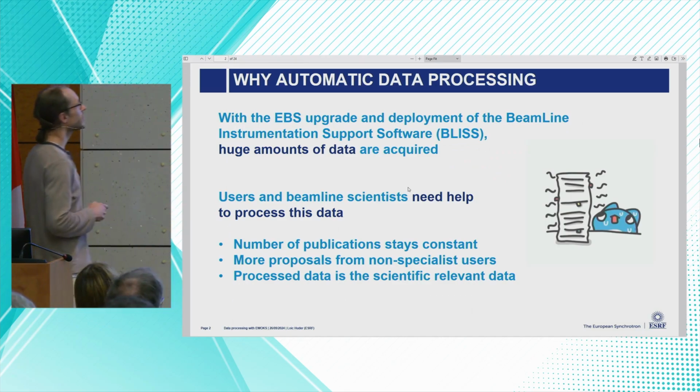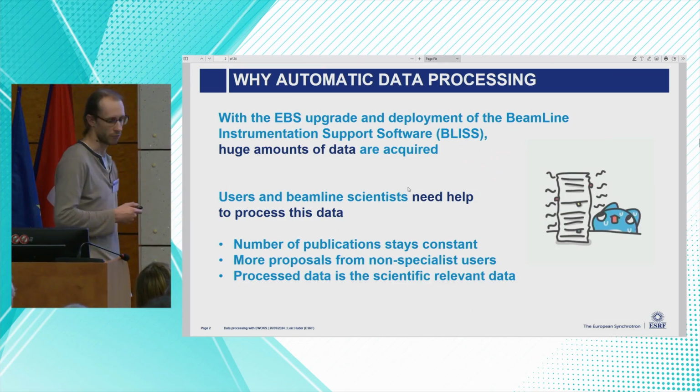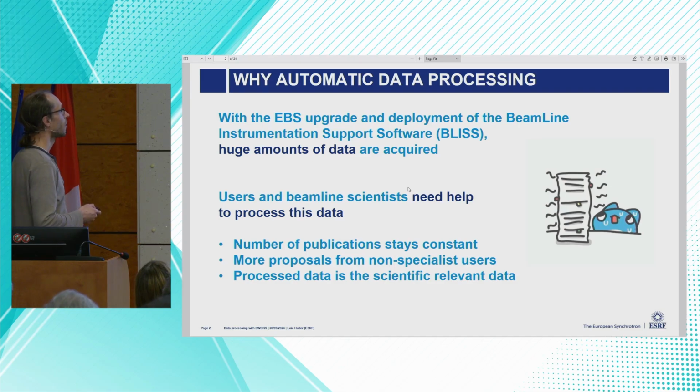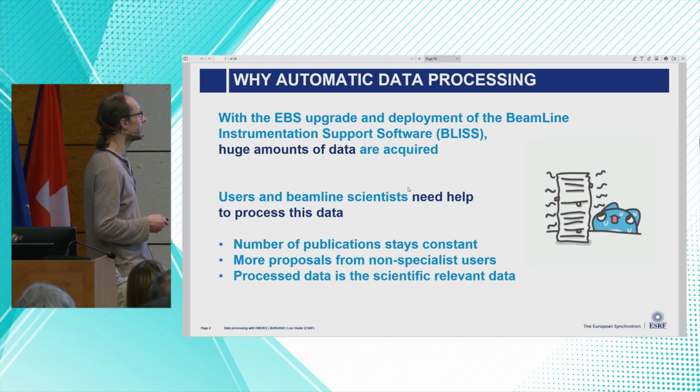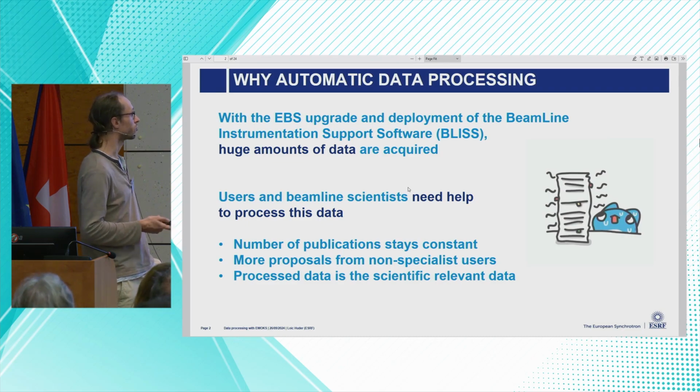Why do we need automatic data processing? I'll go very quickly on this part because we all are aware that we now have a huge amount of data that are acquired, and the users and beamline scientists need help to process this data.